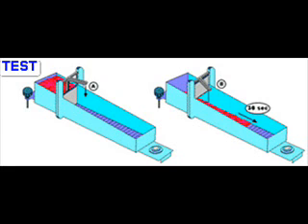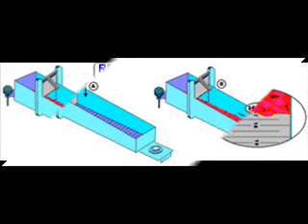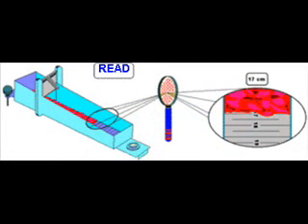At a predetermined time, you look at how far the sample has moved. At that point, you record the number in the trough at the edge of the sample. That's all there is to running a Bostwick consistometer test. Thank you.